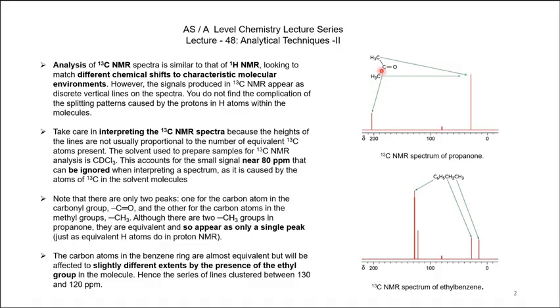So if this is a spectrum, and we did not know the molecule, how would we interpret it? First of all, if you remember, we were talking about the table which is available, the library of NMR spectra, and from there we start looking at how many peaks we have in the spectrum, and what the shift is for each.